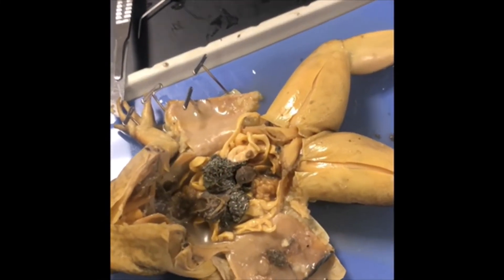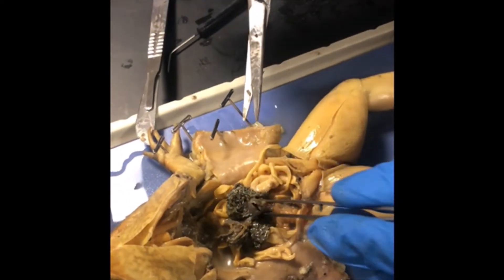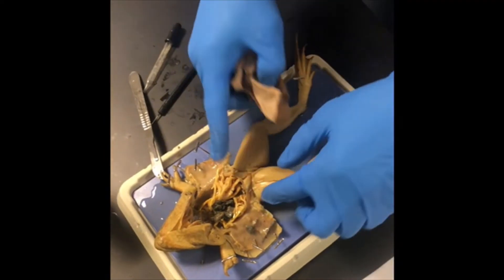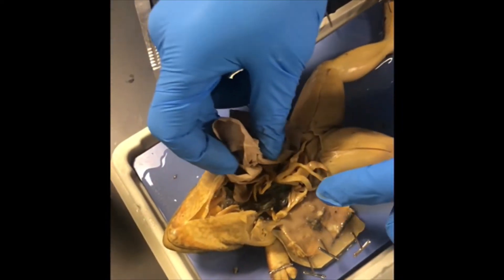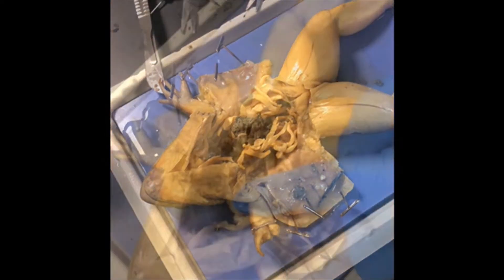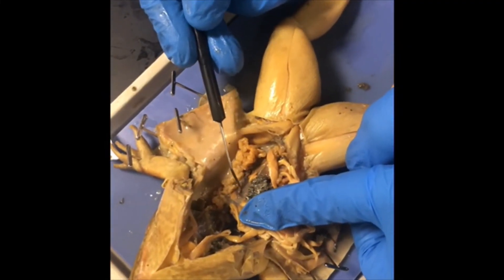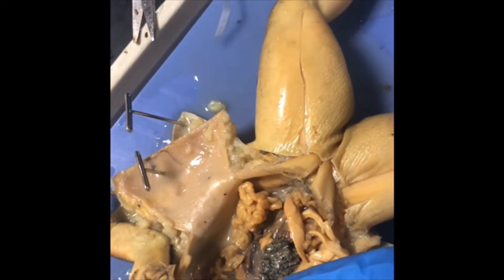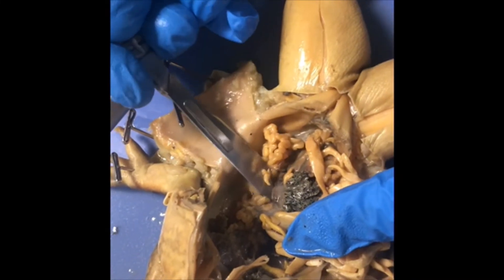We're going to remove the spleen now and put it on the placemat. Look behind the intestines and carefully cut it out with scissors, being careful not to damage the surrounding organs. These fat bodies are kind of in the way, so I'm just going to move them aside and mop up some excess liquid blocking the dorsal side. Here is a brown section — the kidneys actually attach to the dorsal wall. A kidney.